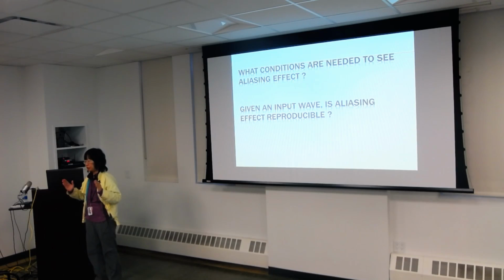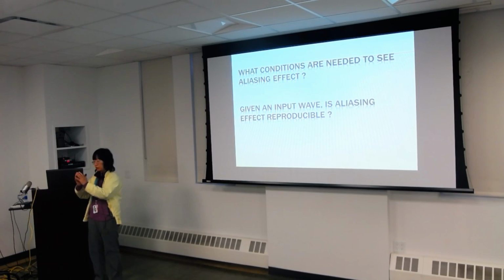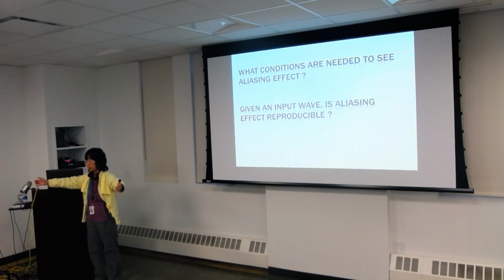So it's always determined by how far I can physically sample, right? You can sample it at certain points, but you can't describe your sine wave or cosine wave with that kind of pixel. Those are things that don't change. Looking at real space, say I have a bigger detector. Does it actually change my Nyquist frequency? In terms of reciprocal angstroms, it doesn't change that.